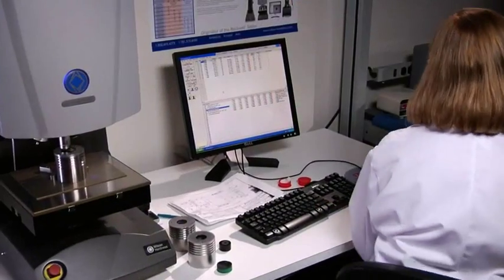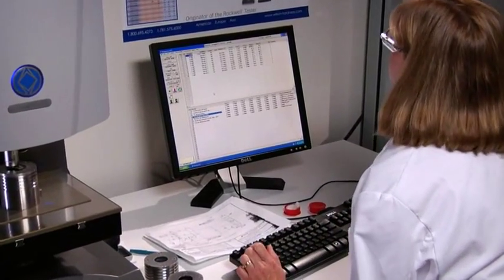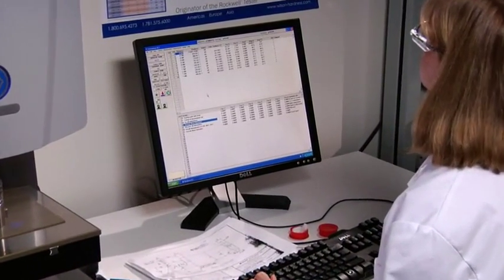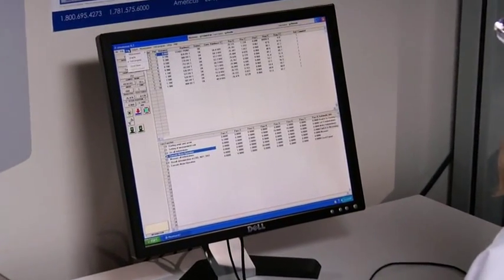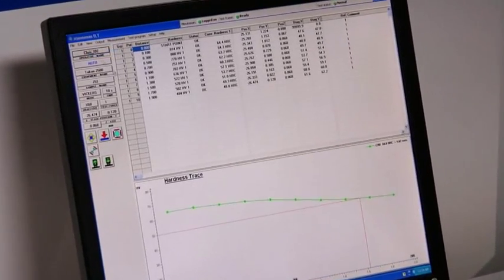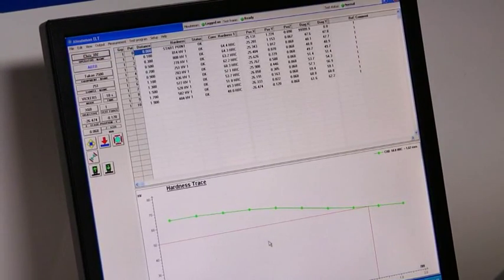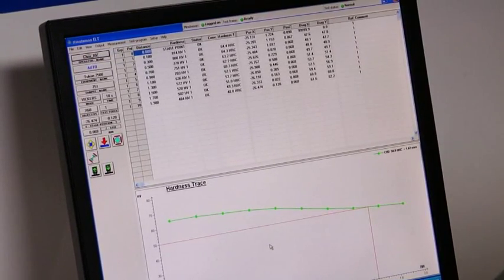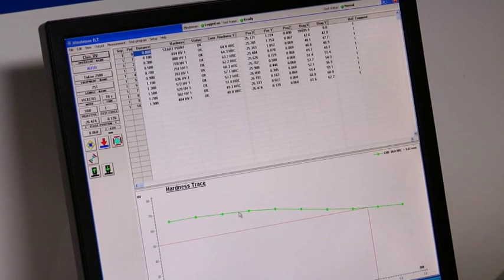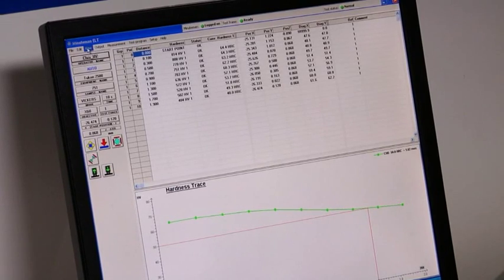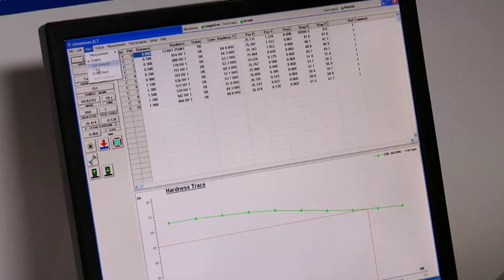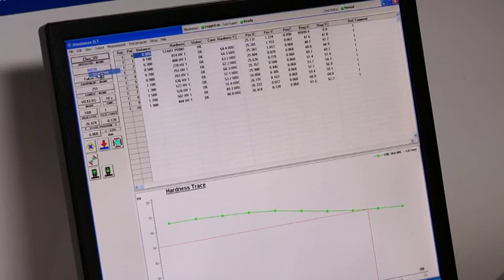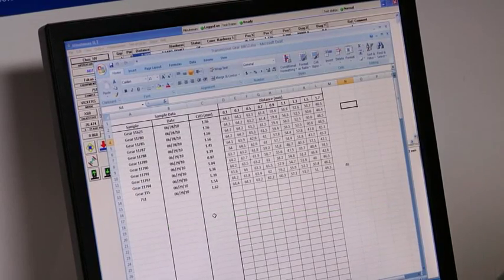All test sample data is rapidly collected and analyzed by the Minuteman software. Measurements then appear on a graph, displaying the case hardness depth results. For easy data handling and reporting, all test sample data can be quickly exported to an array of programs, including Microsoft Excel.